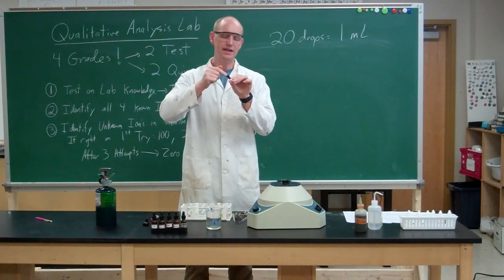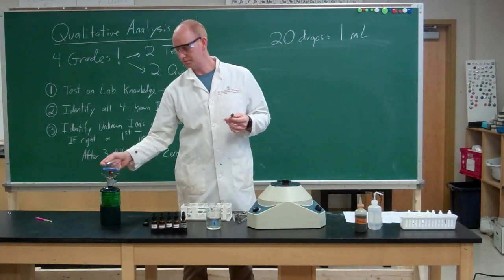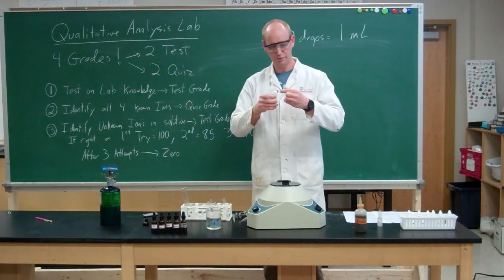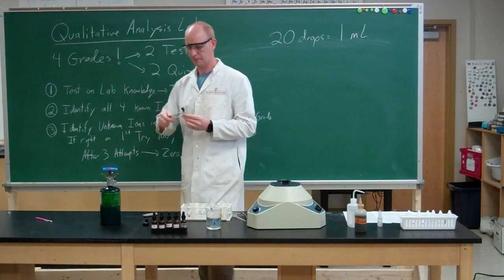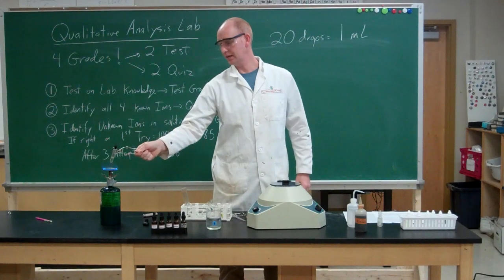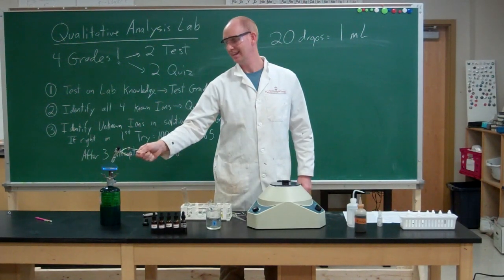But when you put a stopper on a test tube, this creates what's called a closed system. And you never want to heat a closed system, and I'll show you why. I'm going to heat this. That's what you don't want to do. So I have some water in here, and I'm going to stopper this. So if I have my closed system, and I start to heat it, once the water gets warm, it's going to start to vaporize, and when it vaporizes, it's going to generate pressure. And pressure in a closed system is never good.